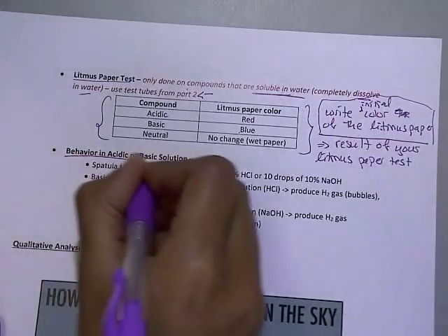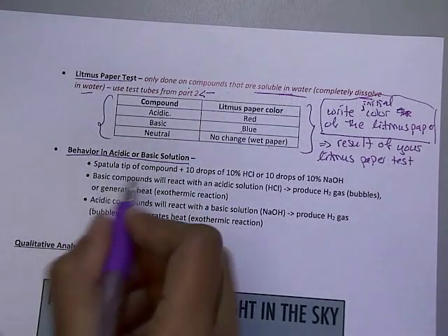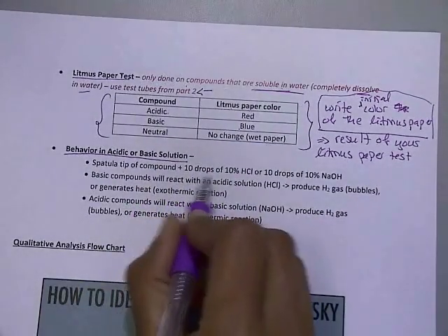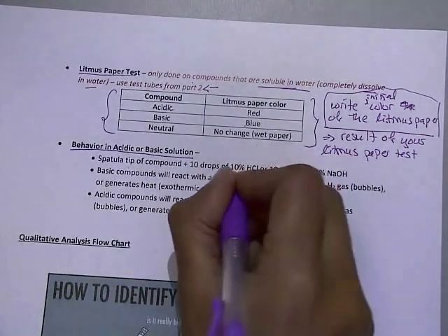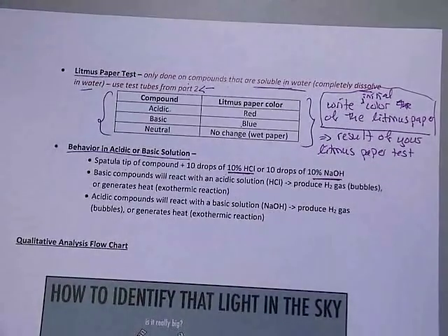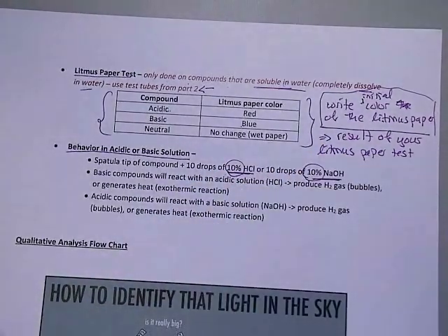The second part of part 3 for this experiment, under acid and base, is to investigate the behavior of your compounds in acidic or basic solutions. So take a spatula tip, again a very small amount, of your compound, add 10 drops of HCl to it, and then in another test tube add 10 drops of NaOH. Make observations. Again, make sure you make initial observations of hydrochloric acid and of sodium hydroxide.